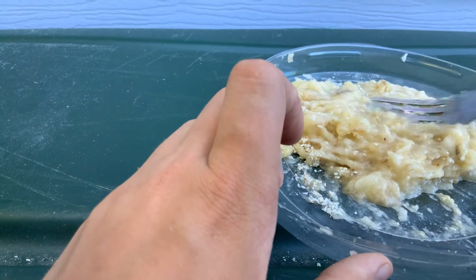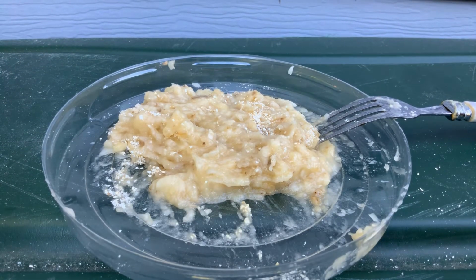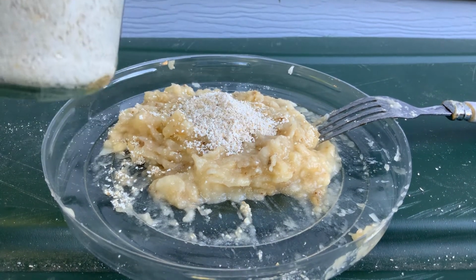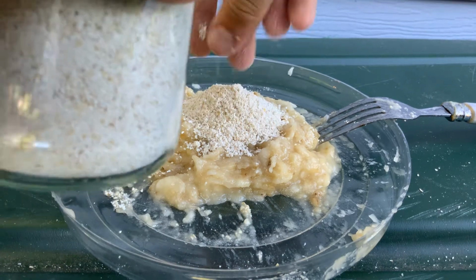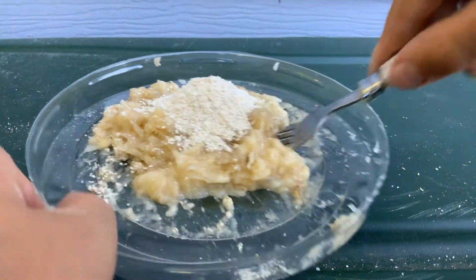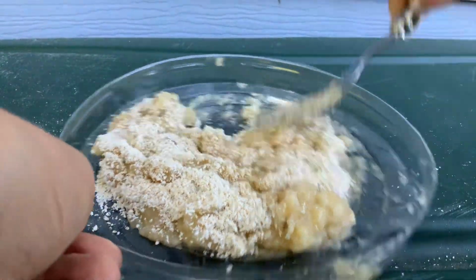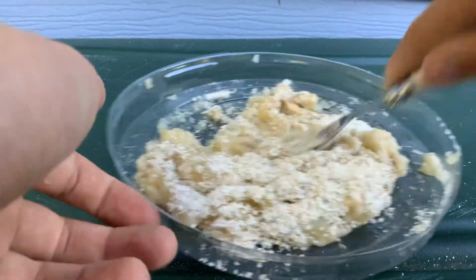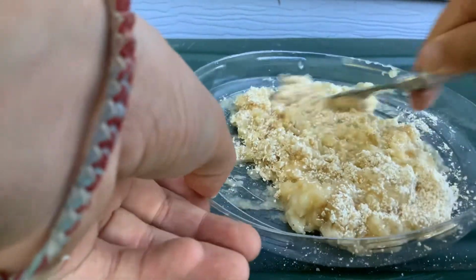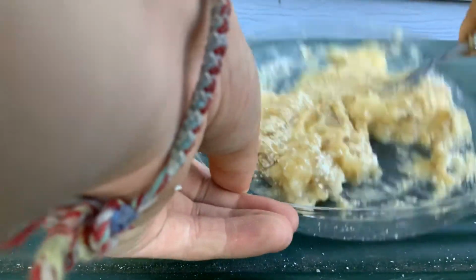Here we are. Gonna mix in some more. All right, more, and more, and more. That should be good. That's a lot. Wow. All right, and then just mix this up. It'll turn pretty dry, but that is when the vinegar comes in. And the vinegar keeps it from molding a whole bunch.